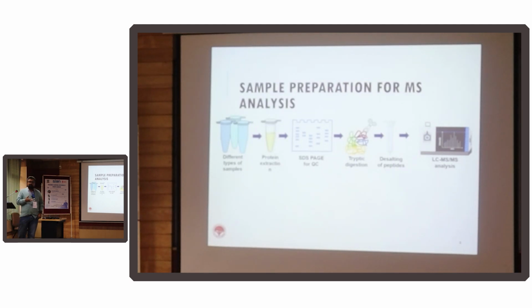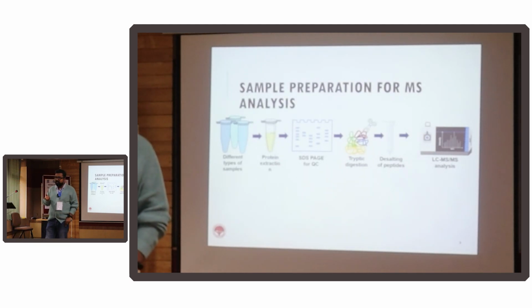Then we have to desalt the peptides. The reason we have to desalt is we have used lots of buffers, and we will discuss lots of buffers. And the mass spec is a very sensitive instrument. We cannot just put anything inside it, right? Professor Srivastava was telling that we have to use a very high voltage and electrospray ionization. He was talking about John Fenn, who developed this technique, because primarily mass spec has been around for more than 50 years.